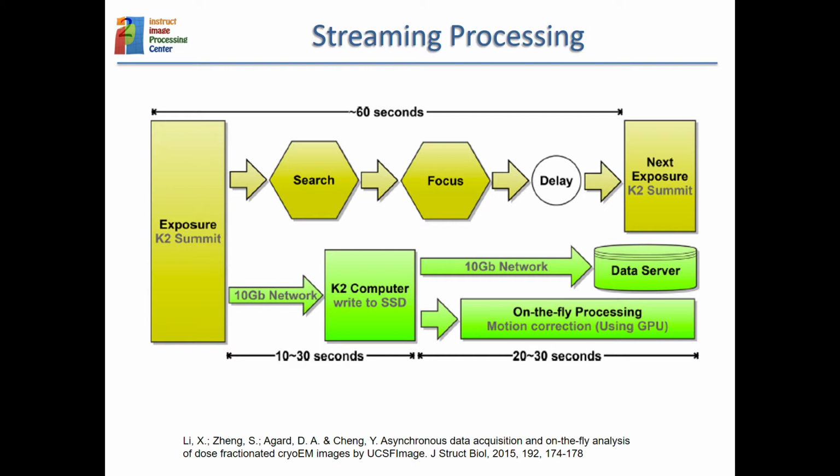At that time you had 60 seconds between one micrograph and the next, and now they are not micrographs, you have movies, and typically much less time between one movie and the next. Currently it depends on the acquisition scheme, but it can go from 5-10 seconds to 20 seconds.